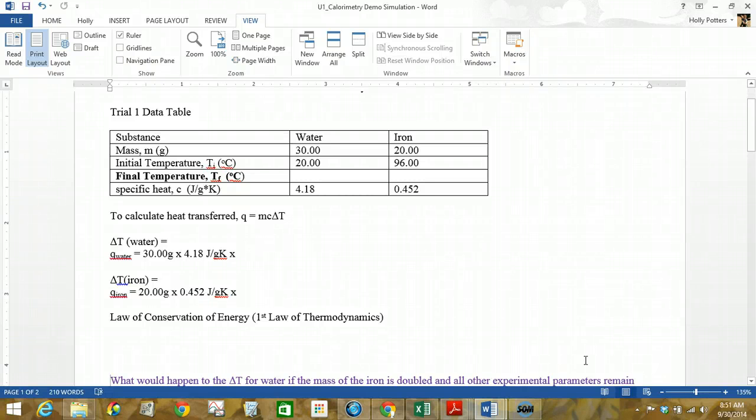In this lesson, we're going to take a look at a calorimetry demonstration so that we can see how we can use the Q equation to calculate the amount of energy transferred in a process. This is a very common experiment that you might have seen in freshman physics or in first year chem. But let's just take a look at heat transfer between water in a calorimeter and a piece of metal.